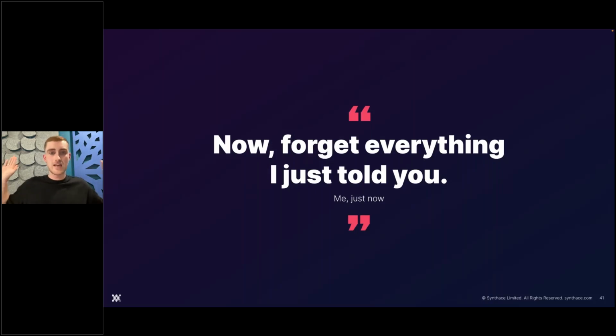Now, forget everything that I just told you. For the entire webinar so far, I've told you about liquid classes, why they're important, and how we optimize them, but do we need them at all? There are going to be some caveats to what I'm about to say, but hear me out. What if we had liquid class agnostic robots? Robots that didn't need liquid classes. What if they could just handle any liquid with no fuss?